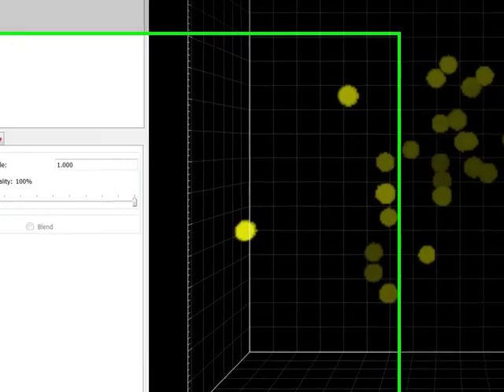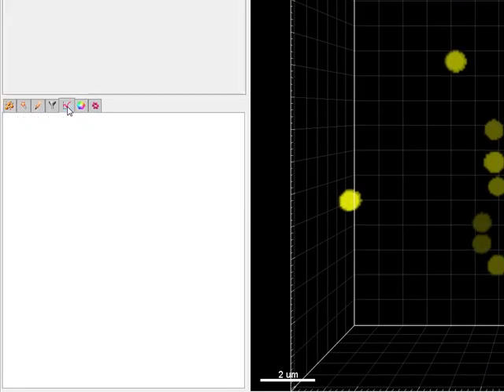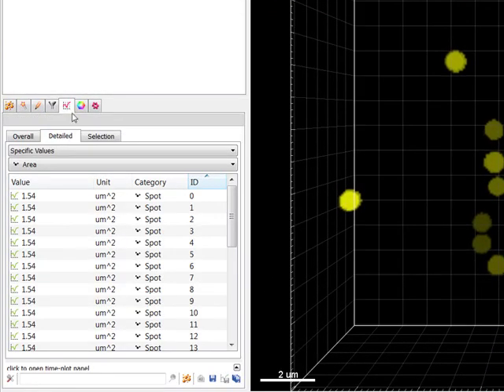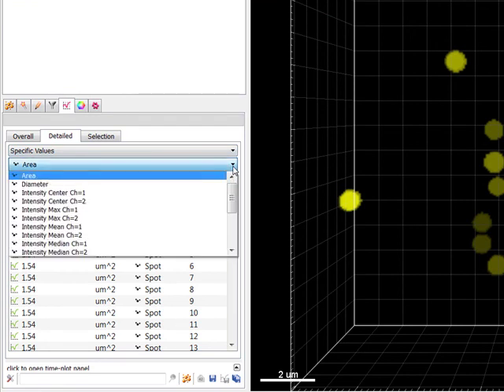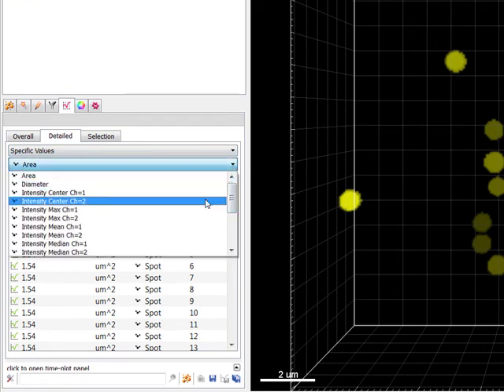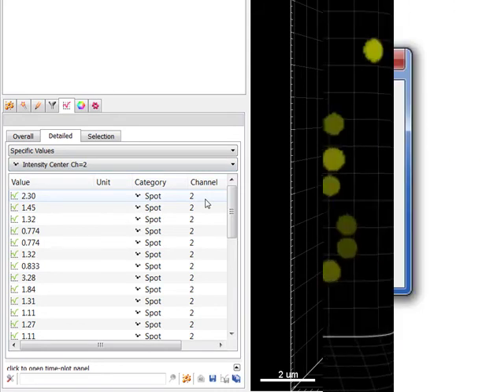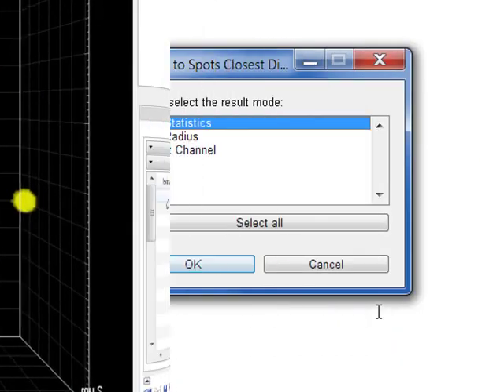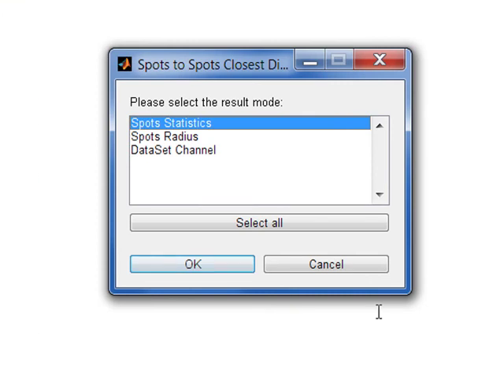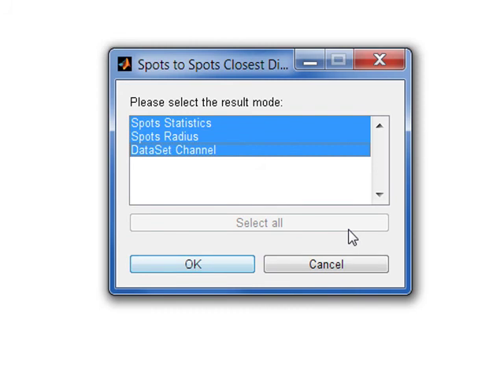Under the Statistical tab, a new variable shows the intensity center of the newly created channel indicating the distance to the next spot. Selecting multiple results is available by pressing the Select All button.